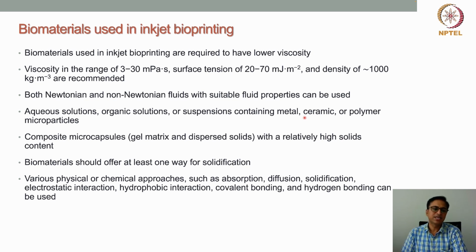Similarly, in certain cases, a few researchers have also used composite microcapsules like gel matrix and dispersed solids with a relatively high solid content. So a few researchers have shown the capability of using this kind of material for inkjet 3D printing, right?